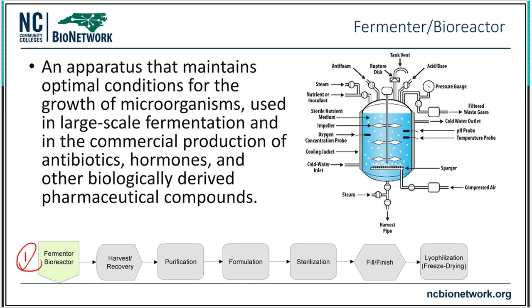All right, so in other words, what this means is that this fermenter, this bioreactor step, folks, this is my aquarium tank, okay? I've got an aquarium tank. There's fish on the inside. It is my job to take care of that aquarium tank because I don't want my fish to die, right? I want my fish to prosper. I want my fish to grow a long, healthy life. I want my fish to be happy. So I'm going to constantly go to my fish tank and I'm going to check all of the conditions. I want to make sure that it's clean.